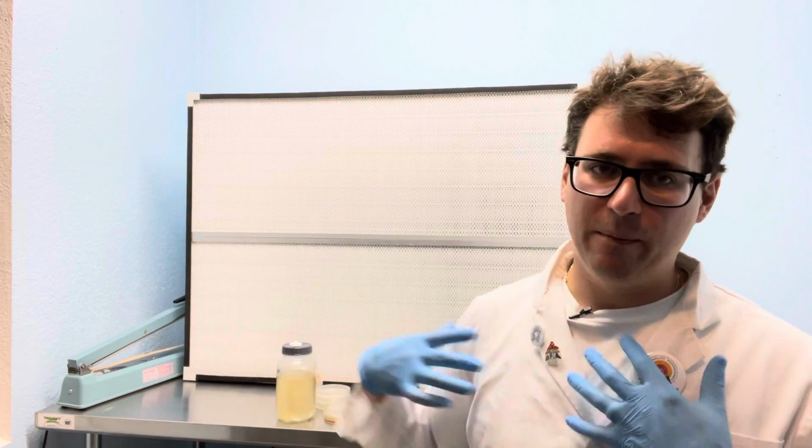I believe you should utilize all of these tools, and you shouldn't really rely on one or the other, because there's a time and a place to use agar and liquid culture, and I believe both of these technologies have really helped to advance the mycology industry itself.